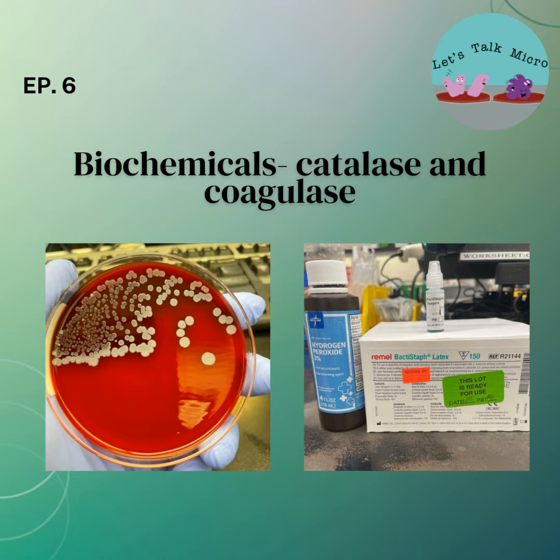Bacteria have certain reactions to certain biochemicals. They produce enzymes, and when you add a biochemical, it causes a reaction that you can observe, like agglutination or some color change. It definitely helps in identifying your bacteria.